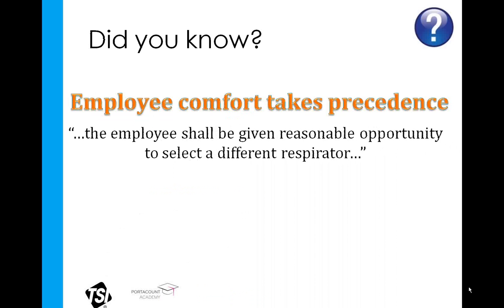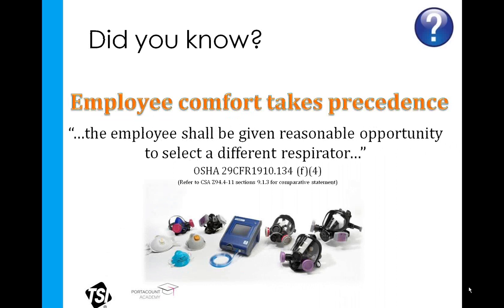As I said previously, a topic that is often overlooked during fit testing is employee comfort. So I want to take some time and address that directly. One part of the OSHA fit testing standard that I rarely see followed is that the employee being fit tested must don the mask for 5 minutes before the fit test begins.